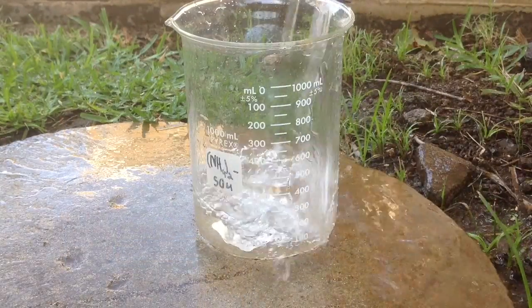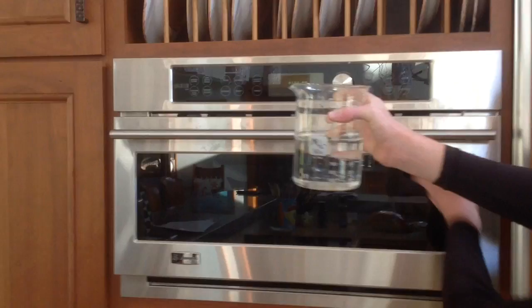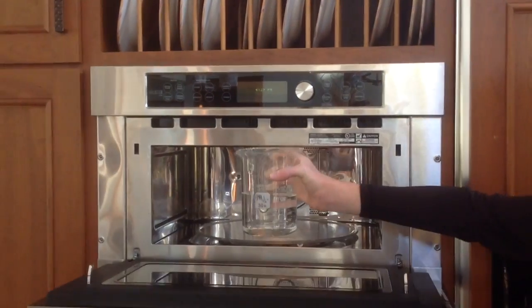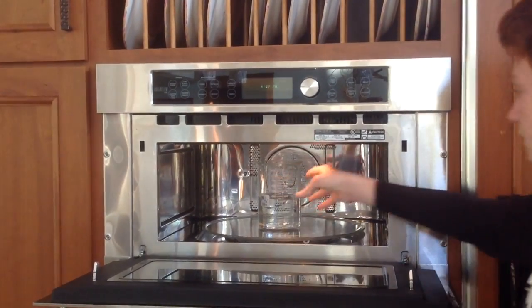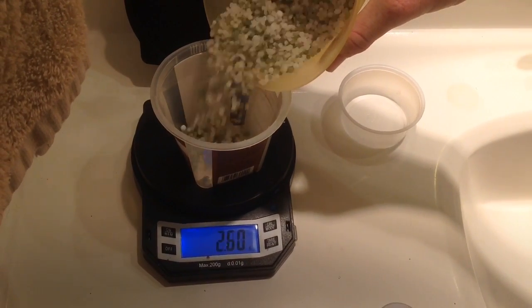The first step I took was filling my 1-liter beaker with 500 milliliters of water. Following that step, I simply put it in the microwave for 2 minutes and 30 seconds. As you can see, the next step is weighing out my fertilizer.